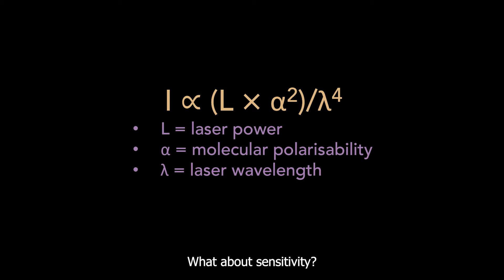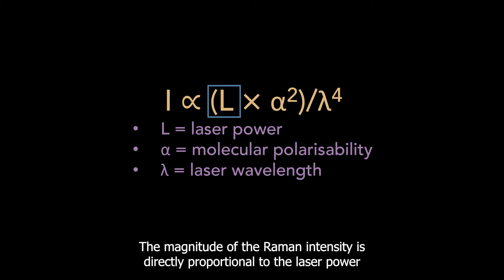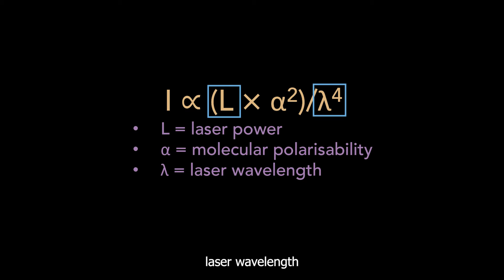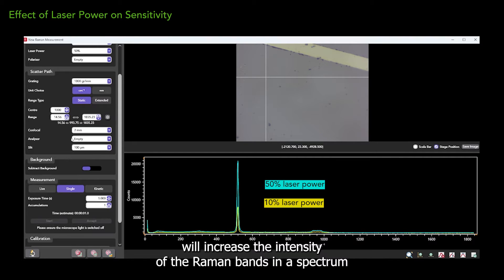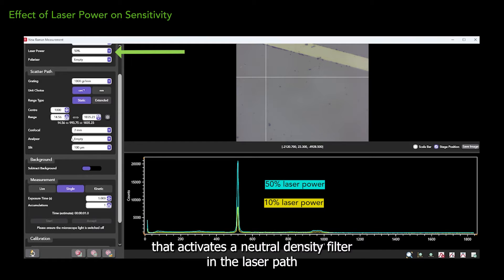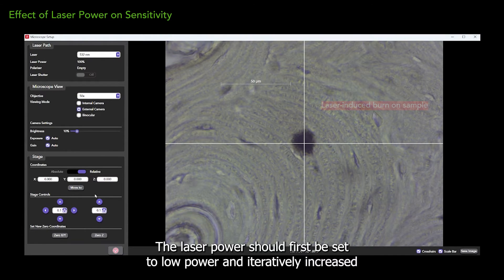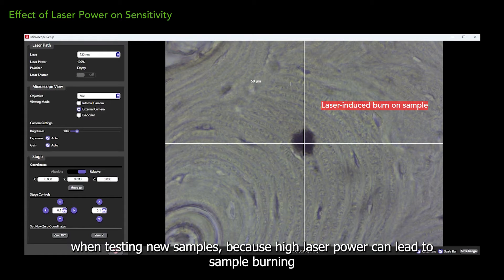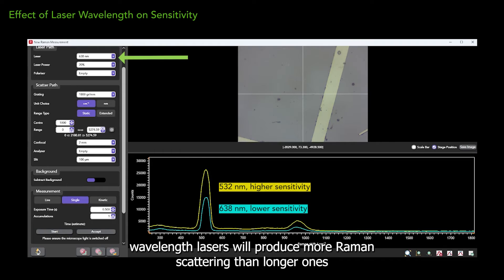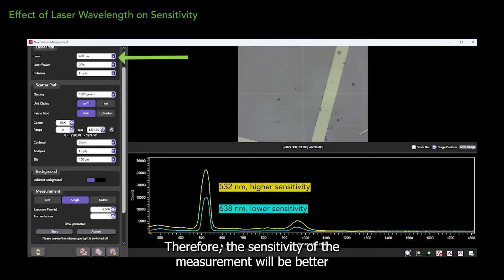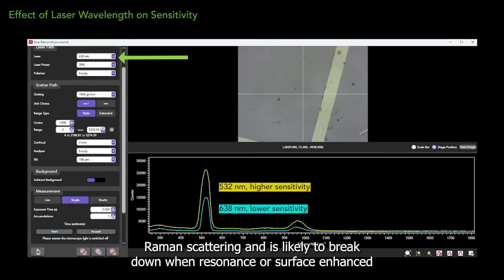The effect of the laser on sensitivity can be summed up in the equation that defines Raman scattering intensity. The magnitude of the Raman intensity is directly proportional to the laser power, and has an inverse fourth power dependency on laser wavelength. This means that increasing the laser power will increase the intensity of the Raman bands in a spectrum. Power is controlled in Ramico using a drop-down menu that activates a neutral density filter in the laser path, with the 100% option meaning complete transmission of the laser. The laser power should first be set to low power and iteratively increased when testing new samples, because high laser power can lead to sample burning. The inverse fourth power dependency of wavelength means that lower wavelength lasers will produce more Raman scattering than longer ones, and therefore the sensitivity of the measurement will be better. However, this rule only applies when the effect being measured is conventional Raman scattering, and is likely to break down when resonance or surface enhanced Raman scattering is measured.